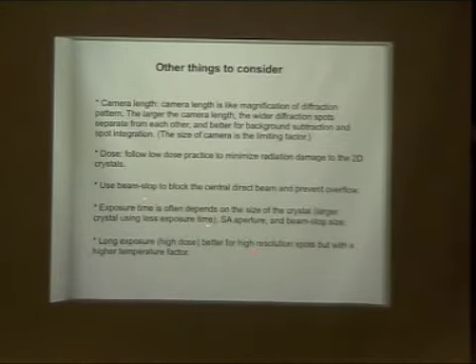Now you're also using a beam stop to block the central direct beam, to prevent overflow. All cameras have an overflow problem, so if you have too strong overflow in the center, it actually can ruin your diffraction pattern. Now, the other thing is that people often ask what exposure time, and this depends on what aperture you select, how big the crystal is, and things like that.